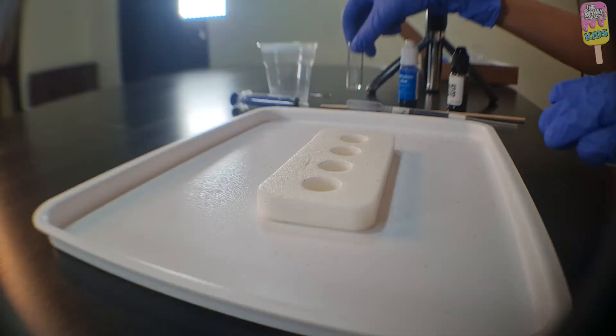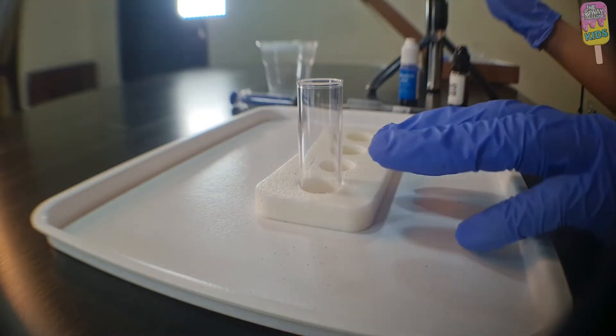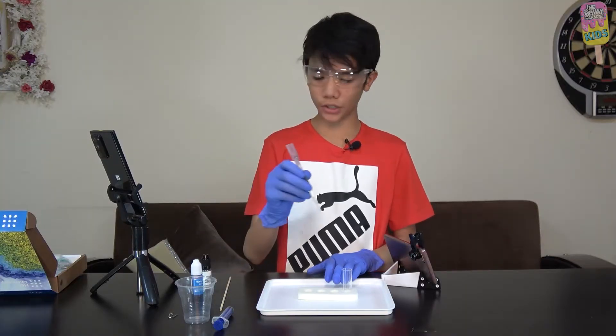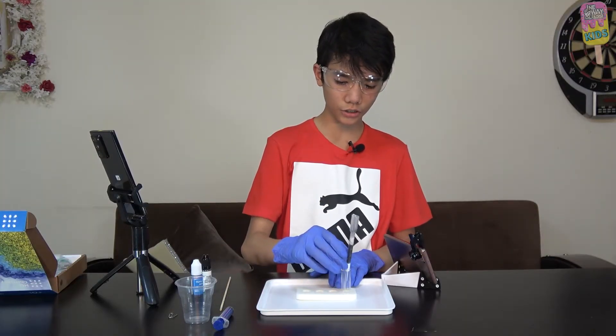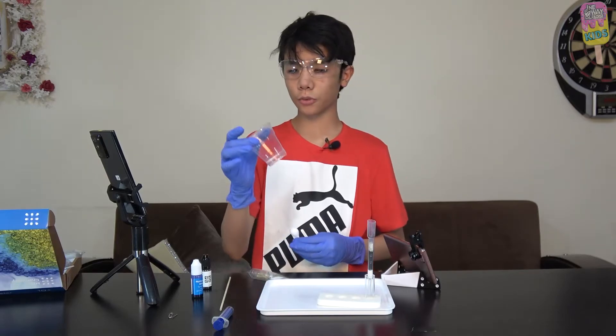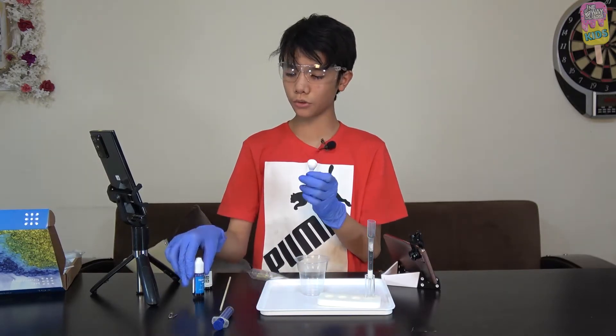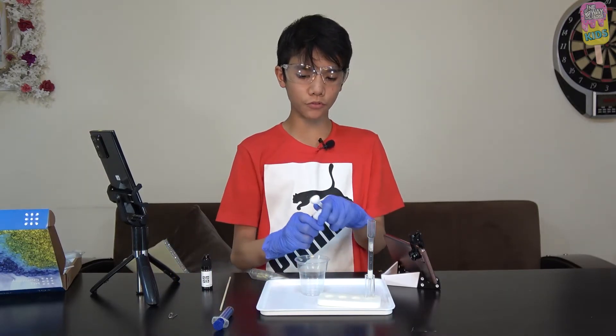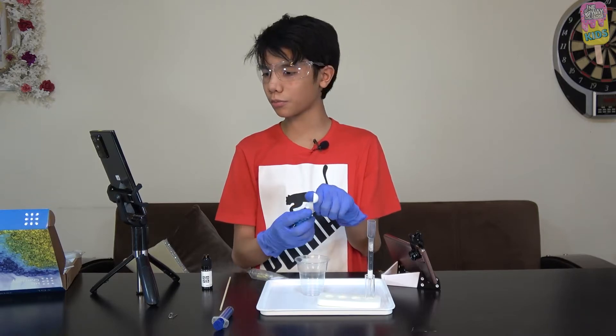I'm going to insert a plastic vial into the test stand and put the carbon filter inside just like this. Next, I'm going to get our disposable cup, the measuring spoon, and pour one big spoonful of methylene blue into the disposable cup.